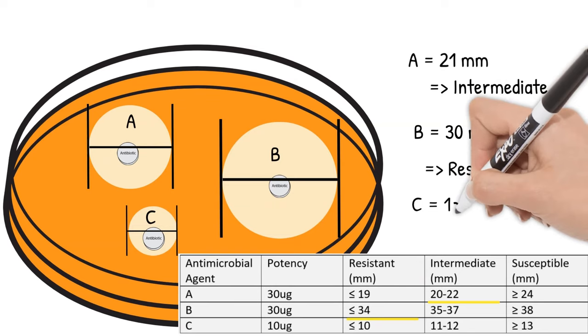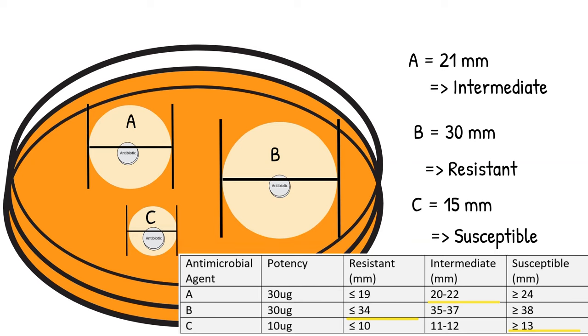Next, Disc C. It looks like 15 millimeters. When I compare to the table, it is susceptible.